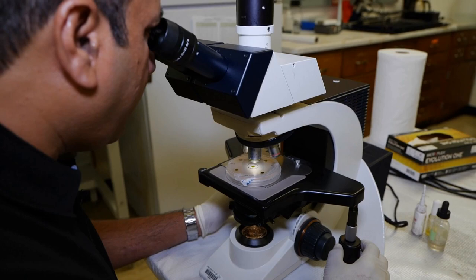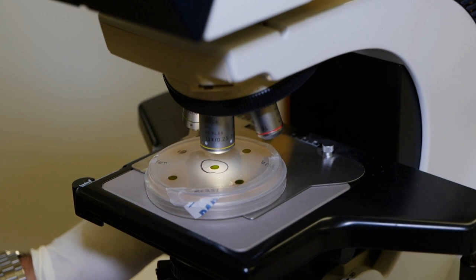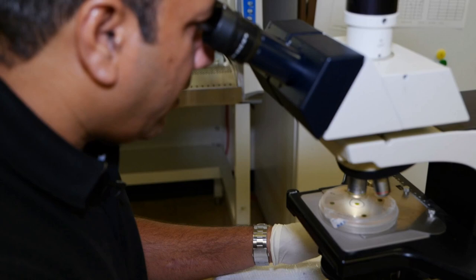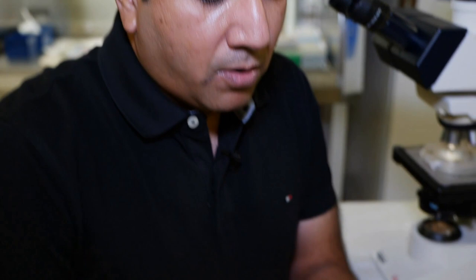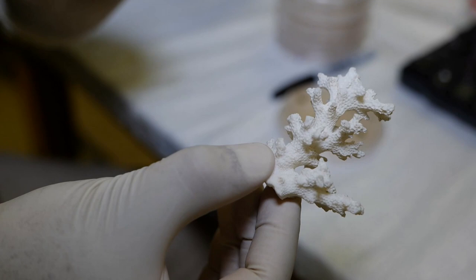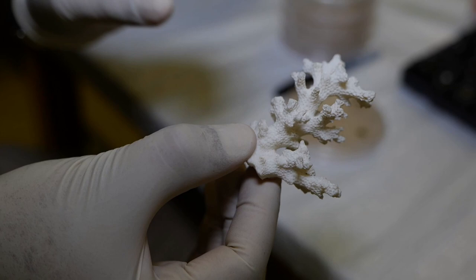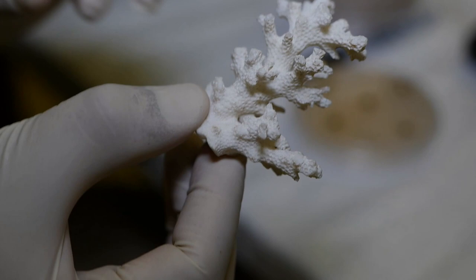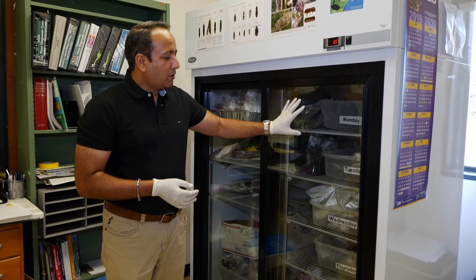By now you have to look at it under the light microscope and see if it's producing the mycelium that you're looking for. Depending upon the type of the mycelium, you can tell if it is a phytophthora or not. Here I have a good example of the phytophthora mycelium how it looks like. This is actually a coral reef, and the mycelium will look exactly like that - it's knobby. If you can imagine this shape, the phytophthora, most of the phytophthora will be knobby like that. We have a preliminary diagnosis that this is caused by a phytophthora type pathogen.